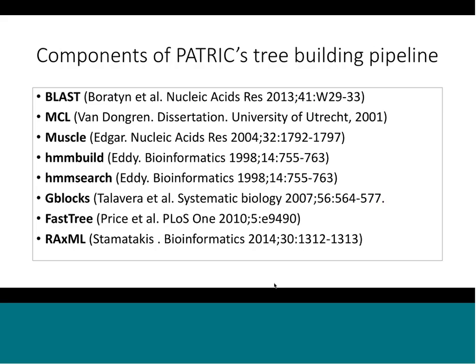So PATRIC's tree building pipeline, or the PEPPER pipeline, has a number of components within it. And I've listed all the components here and the citations for those. Any of you who have attended a workshop or have looked at the PATRIC site, we have a list of tutorials, which I'll show you how to get to later. But at the end of the tutorials, I list all of these different parts of the pipeline with the citations, and I do this for a specific purpose.